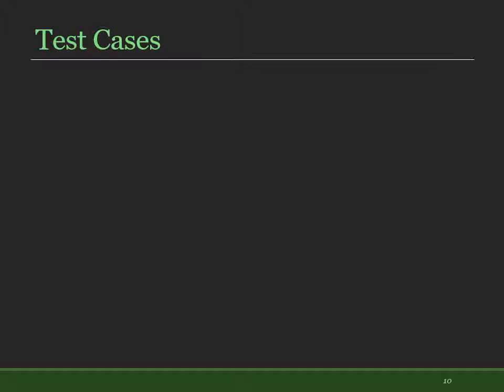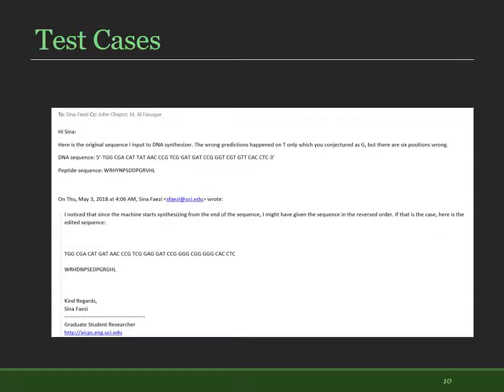We achieved good accuracy for predicting each random base, but to make sure that the attack model will work in a real-world scenario, we crafted a new experiment. We asked one of our collaborators to synthesize a meaningful DNA sequence without giving us any information. We put a recorder near the machine and collected the acoustic noise for 1 day. The next day, we collected the recorded sound and fed it to our trained model. We then emailed the predicted sequence to our collaborator to compare it with the original sequence.